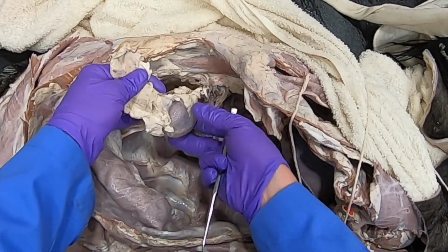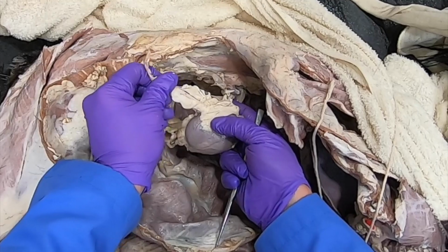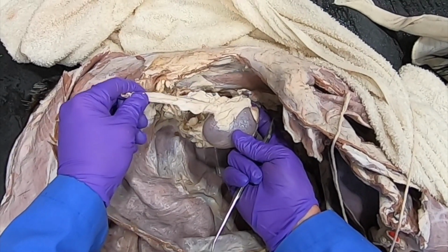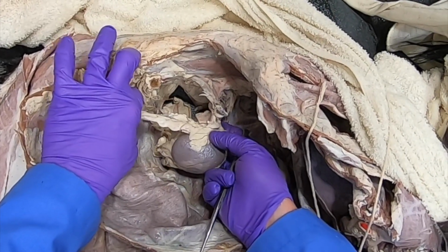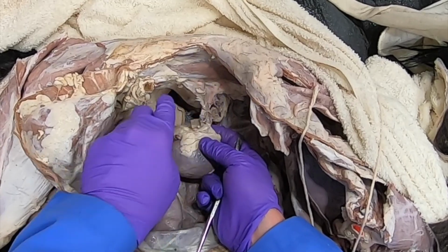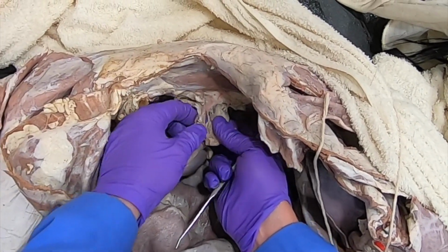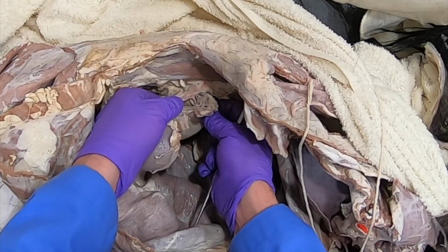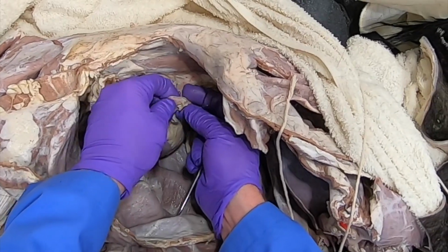Okay, here we have a kidney. We'll open that kidney up in a bit. And here we have the ureter. So the ureter's been cut, unfortunately, but we can see the renal artery coming up here into the aorta, and just cranial to it we should have a structure.